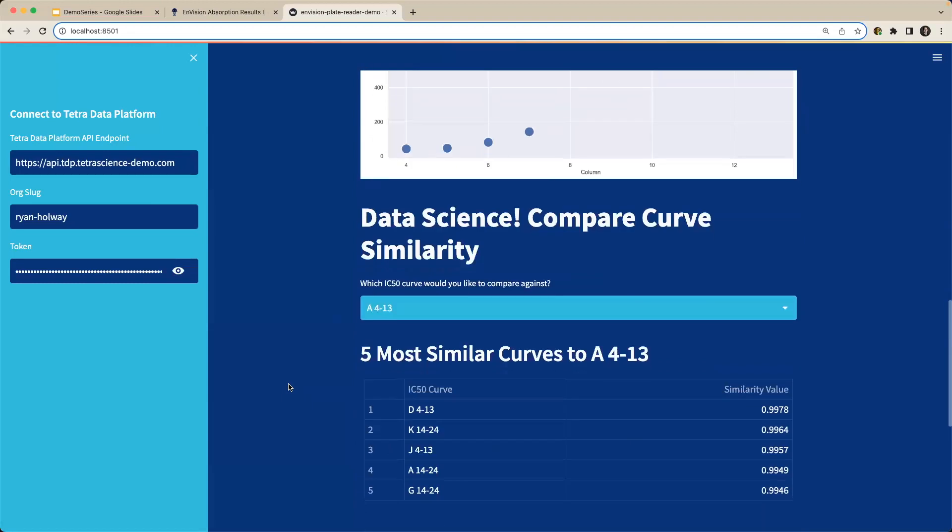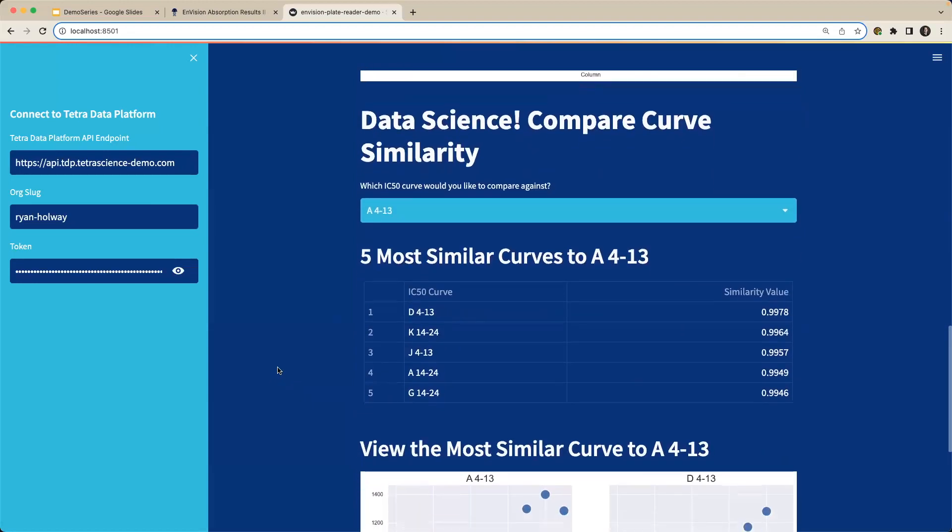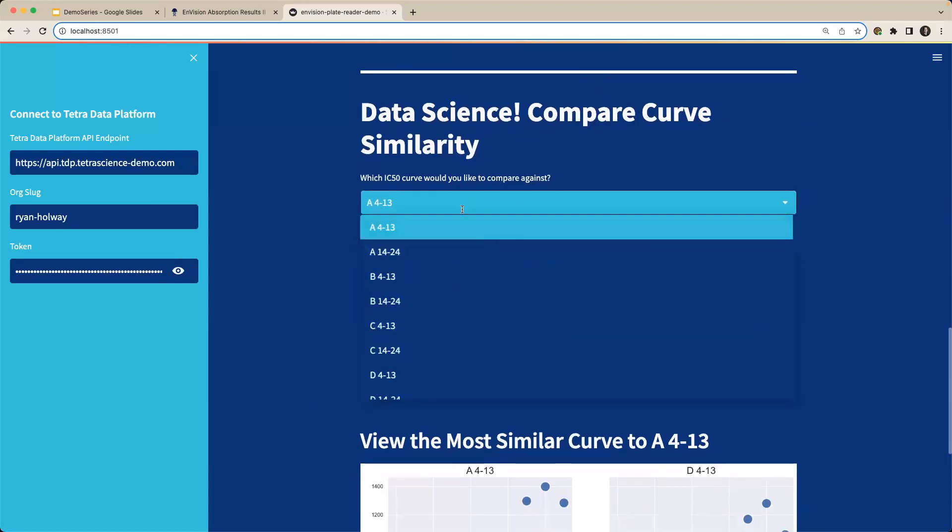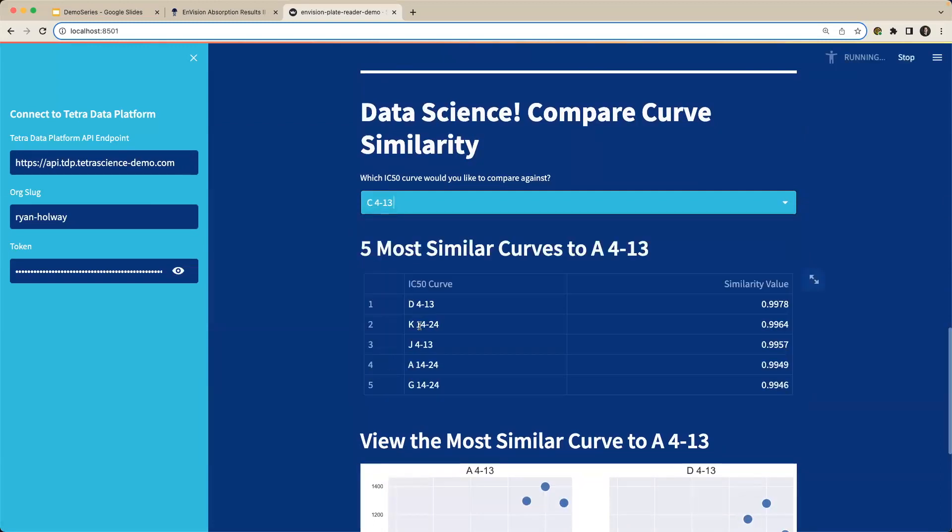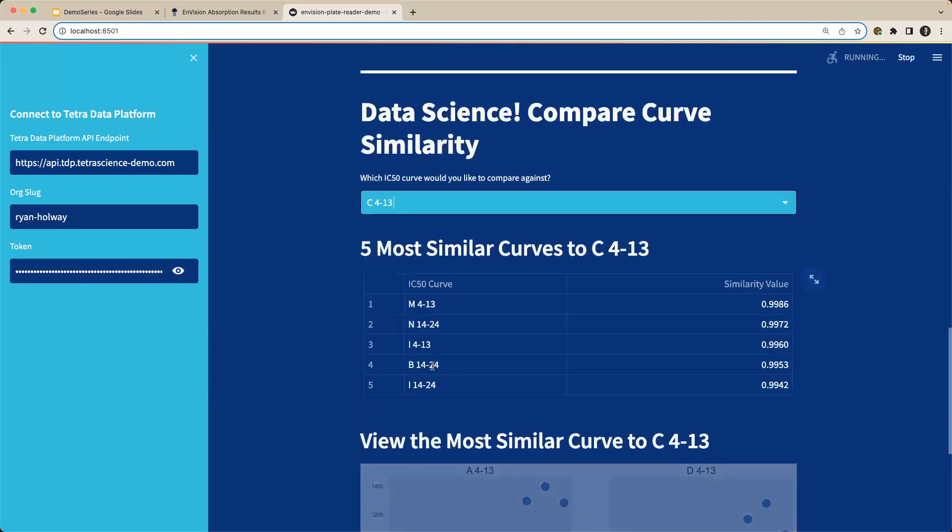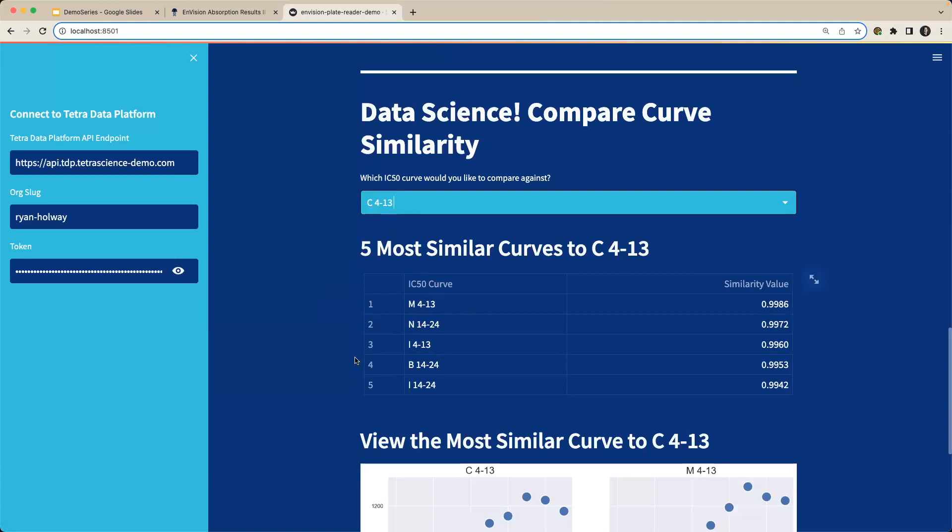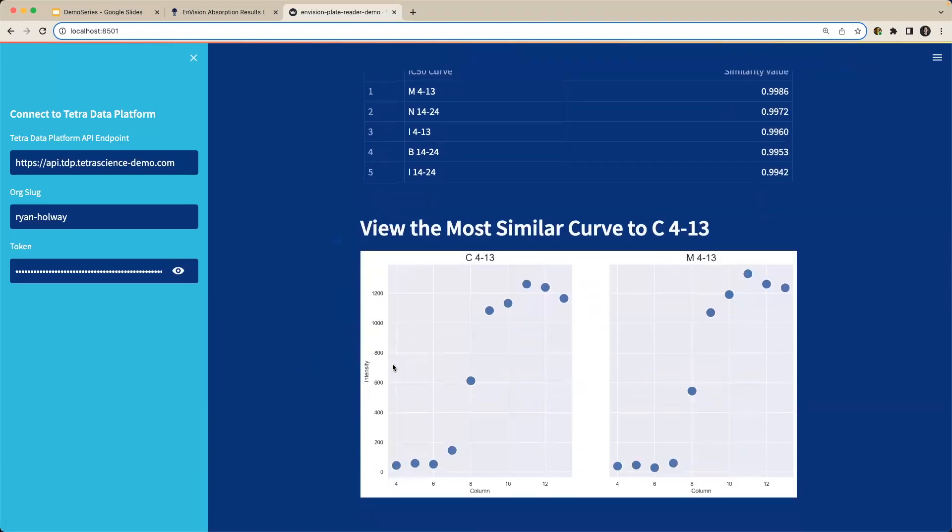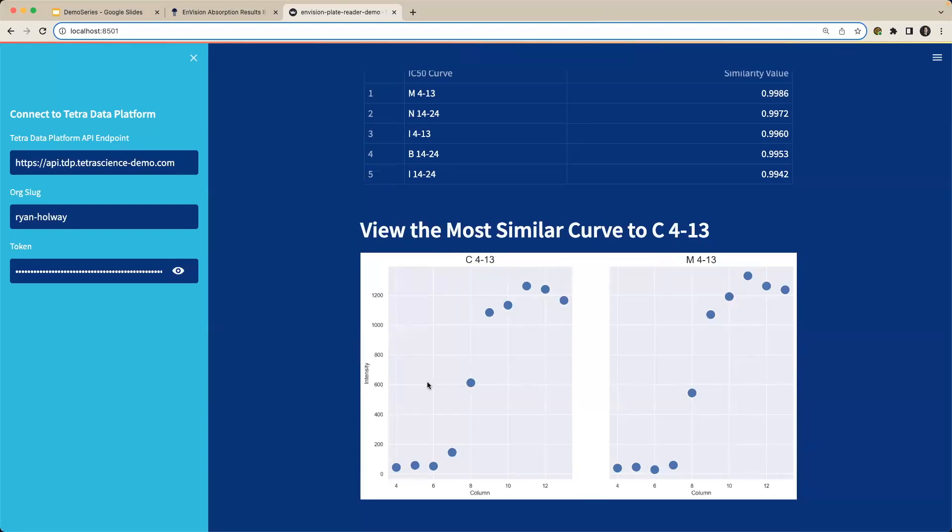And now we have a small data science experiment that we can run here where we're comparing our curve similarities. For example, say I want to select that curve associated with row C. I'll select that curve. And then we're running an algorithm in the background that's selecting the curve most similar to that C 4 through 13 curve. And it looks like that most similar curve is in row M with a similarity value of around 99%. And I can scroll down and automatically I can see the curve of interest as well as the curve that is most similar to it, all on top of our Tetra data platform.